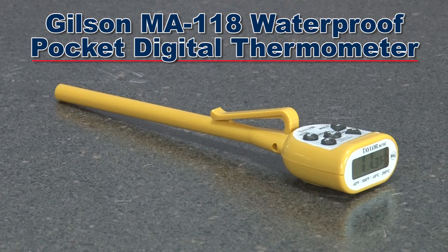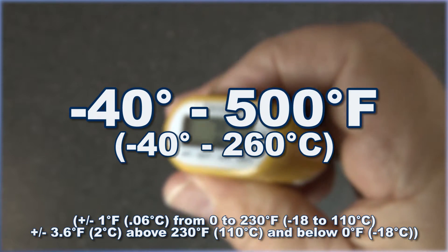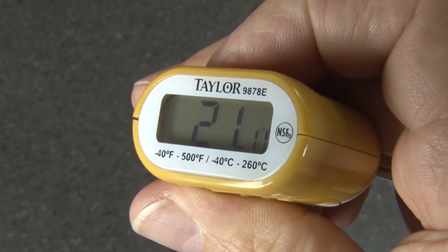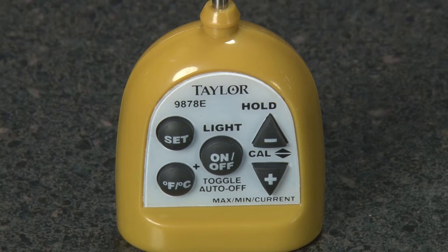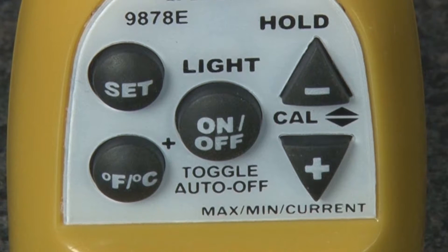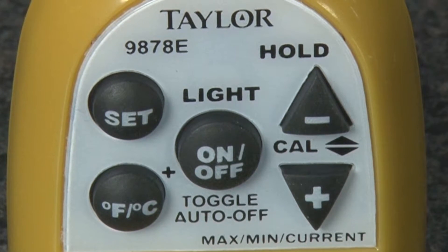The MA118 waterproof pocket digital thermometer has a temperature range of minus 40 to 500 degrees Fahrenheit, shown on a large LCD display. This rugged 5-inch unit has an anti-microbial housing to inhibit pathogen growth. The high-precision MA118 easily switches from Fahrenheit to Celsius, has a maximum minimum temperature recall, a temperature hold feature, and is recalibratable.